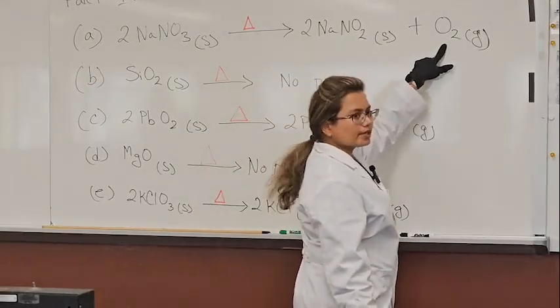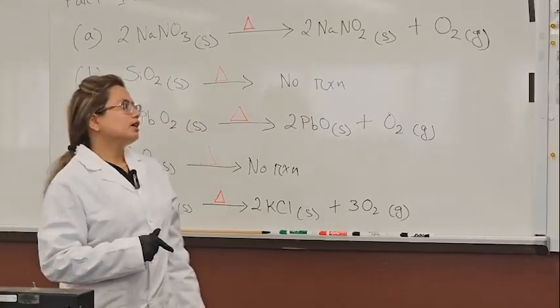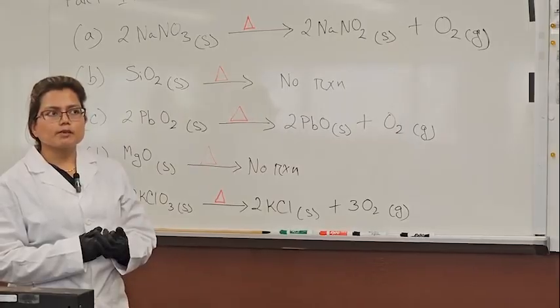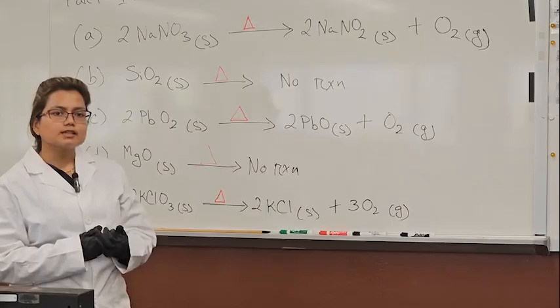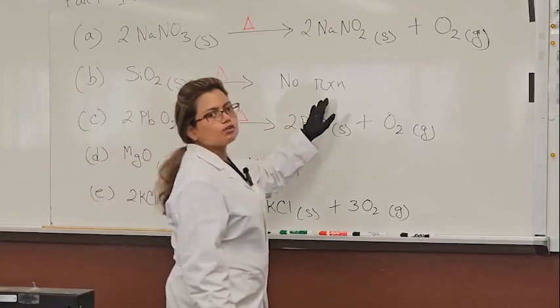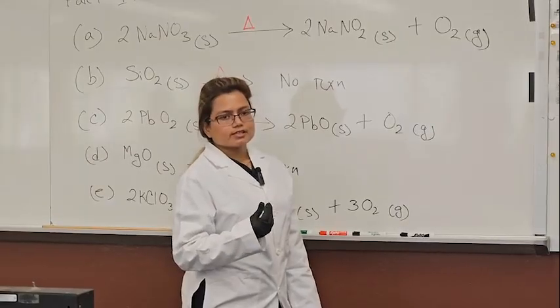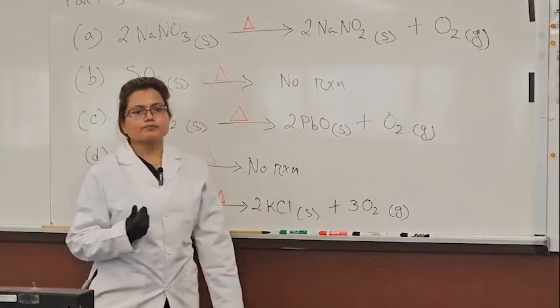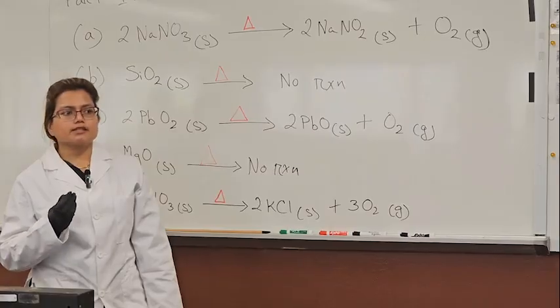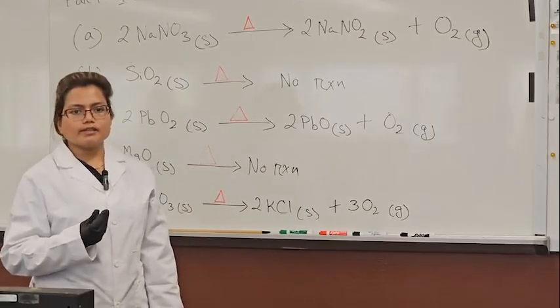But with sodium nitrate, we will see it produce a solid, and also oxygen gas. In this demo lab, we may see some gas produced, but we may be confused about what kind of gas it is. To make sure it is really oxygen gas, we will show a demo. Oxygen helps the combustion reaction, which means it helps to burn any compound.